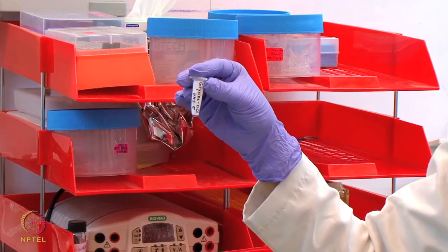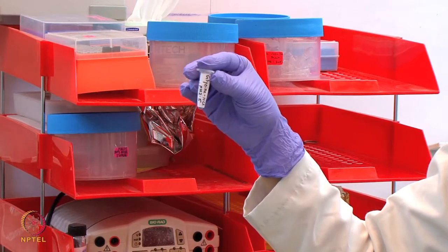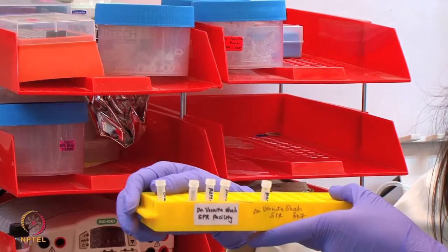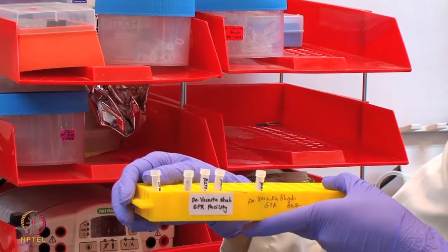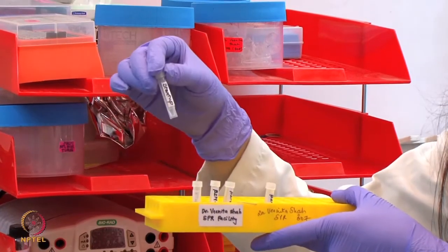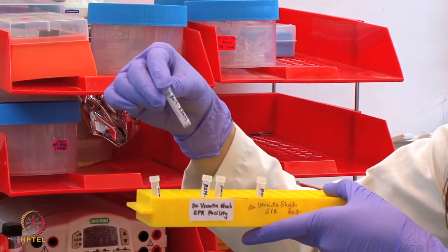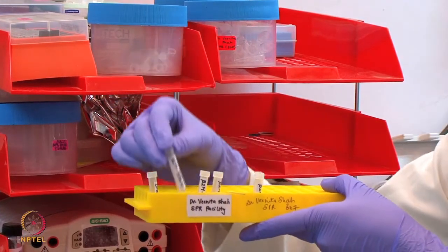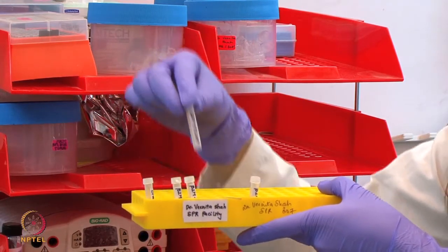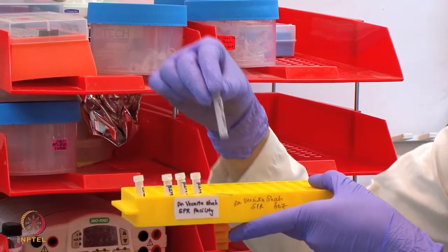For the regeneration of the surface, we have prepared glycine HCl pH 2.5 as the regeneration solution. We have transferred all the solutions in these specialized tubes, starting from the startup, beta-2M concentrations starting from 85 nanomolar, 42.5 nanomolar, 8.5 nanomolar and 0 nanomolar.